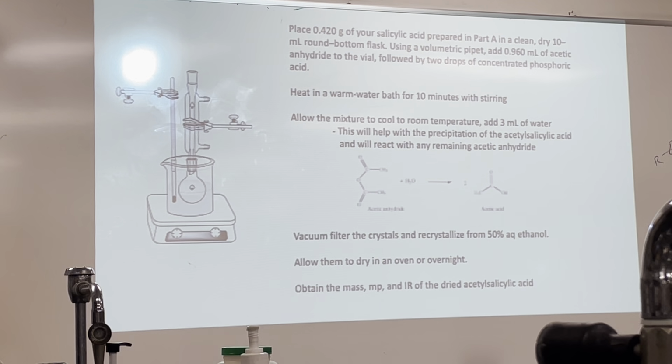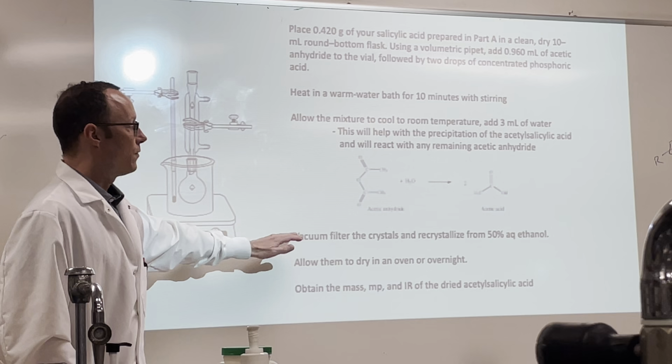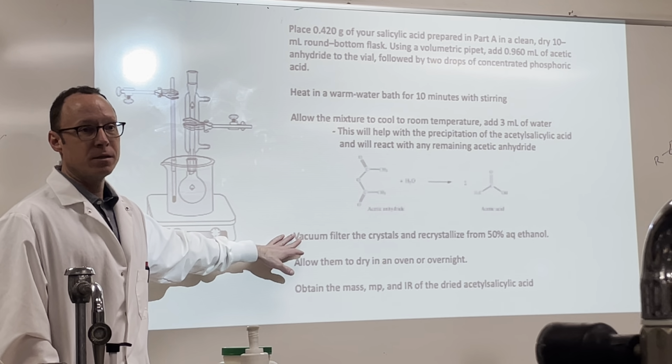You might have to put it in an ice bath for a little bit and scratch at it in the ice bath. Okay, you might have to add a little bit more water. So you're going to have to play around with it to get it to come out of solution sometimes. In the end, you are going to be recrystallizing from 50-50 ethanol water. Okay?